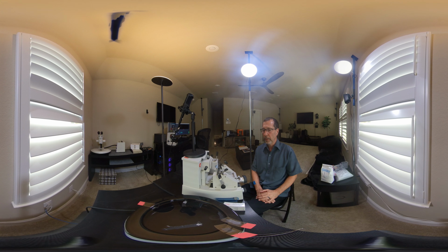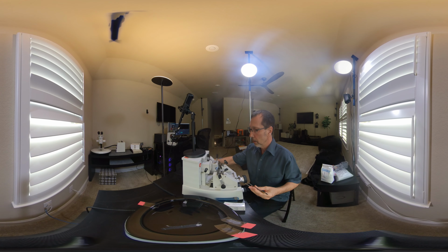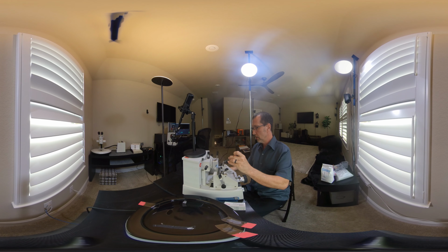So after we cut tissue, I guess I can demonstrate that for you here. So you notice that nothing is moving. This is a block holder, and this is a mold that has been embedded. A piece of tissue is inside there, and this piece of wax is holding it all inside there. And this is the razor blade that's cutting this block right here. So as I cut, you can see the sections, or the ribbon being made.